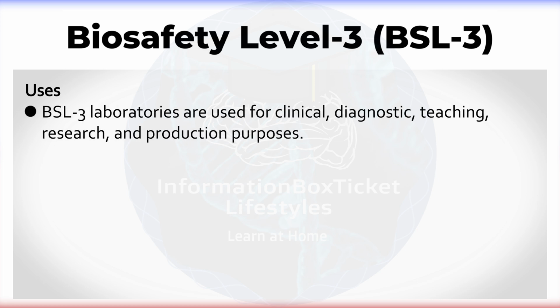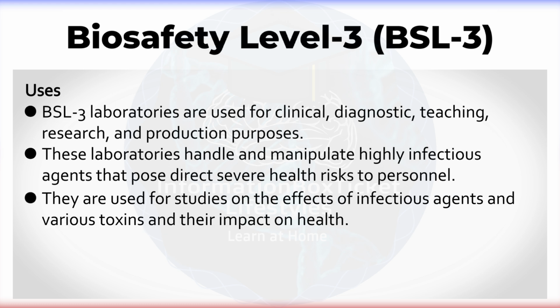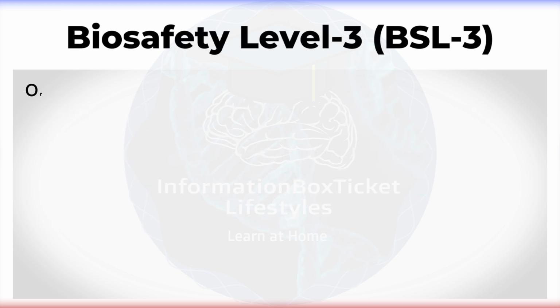BSL-3 laboratories are used for clinical, diagnostic, teaching, research, and production purposes. These laboratories handle and manipulate highly infectious agents that pose direct severe health risks to personnel. They are used for studies on the effects of infectious agents and various toxins and their impact on health.